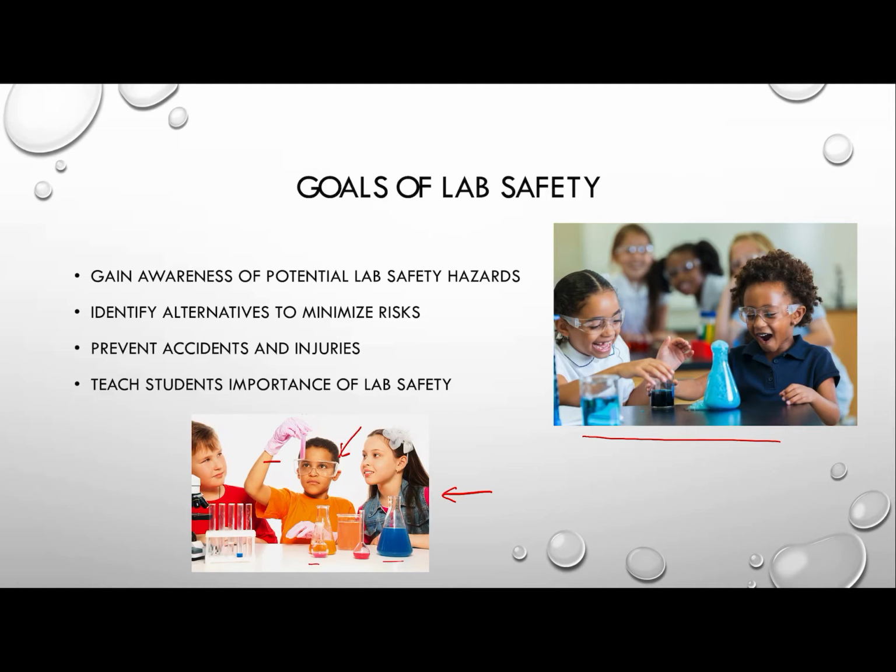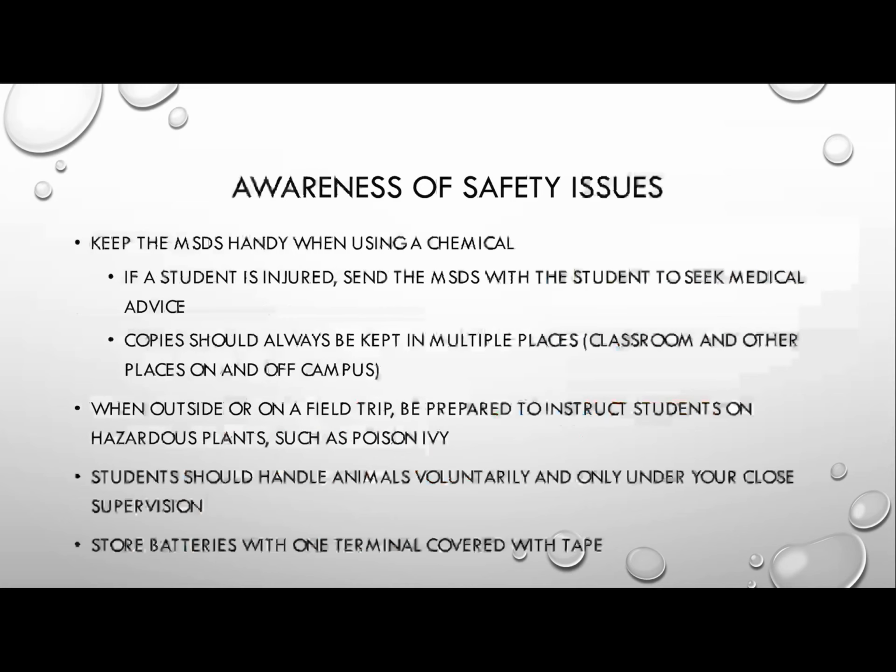And not to mention they're around all of these open containers that have chemicals, probably colored water for this image. But these are things we need to make sure we're aware of. When you're looking around the room, is the safety of the student ensured at all times? Are they minimizing the risks by doing the things that you're asking them to?